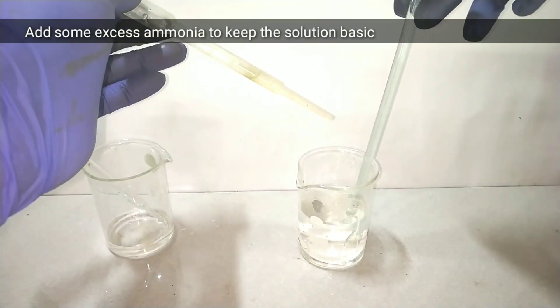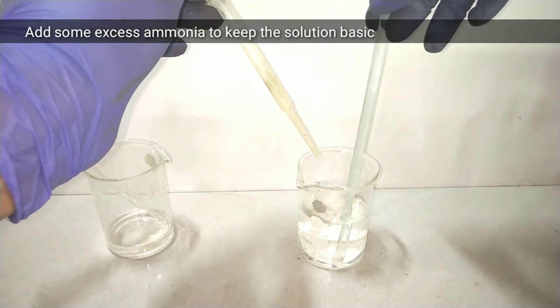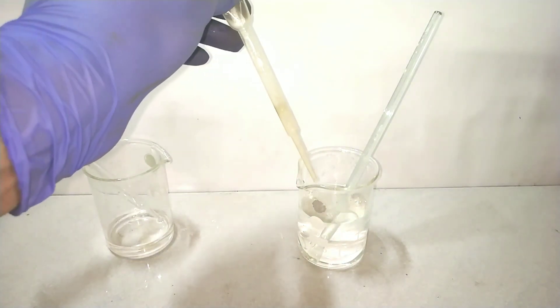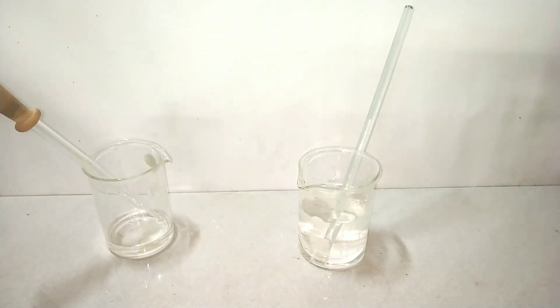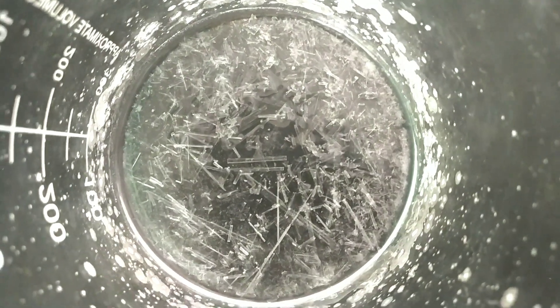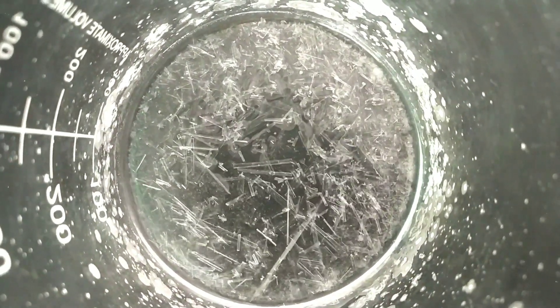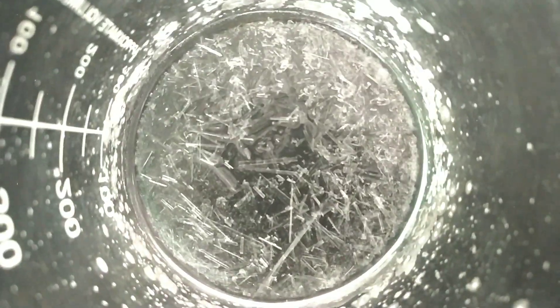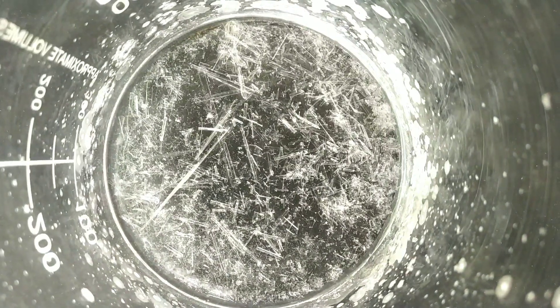After complete neutralization has taken place I will add some excess ammonia to keep the solution basic. Only then we will get the crystals. I then transferred the solution into numerous beakers and let them evaporate in the sun, and on evaporation we get these needle shaped crystals of ammonium sulfate.